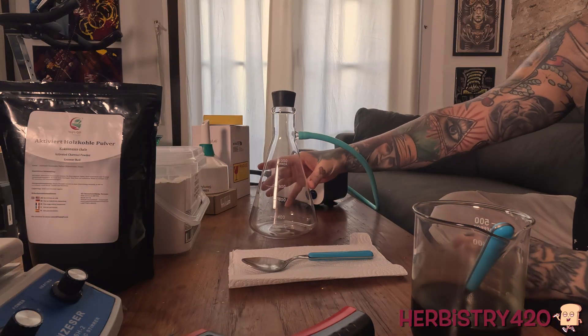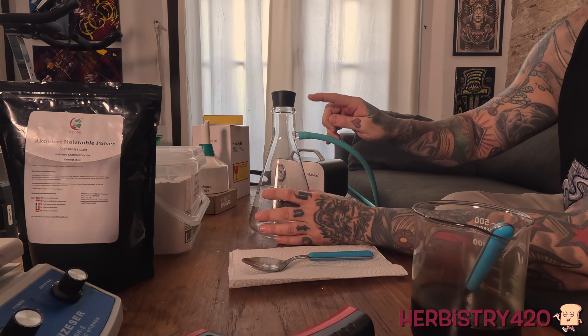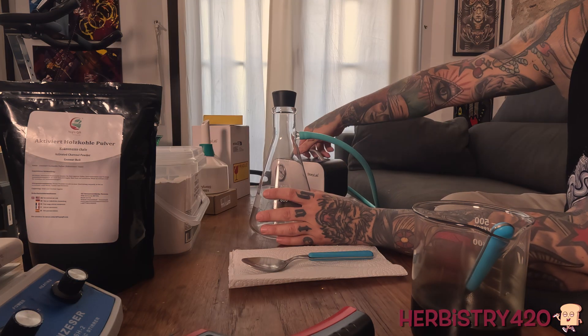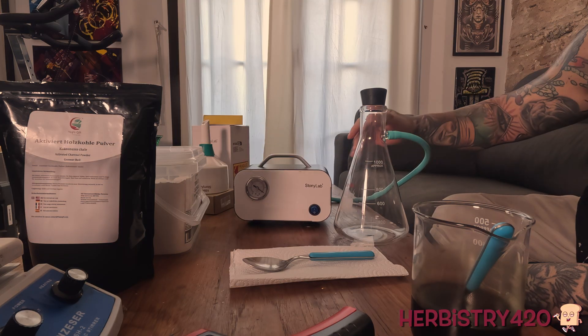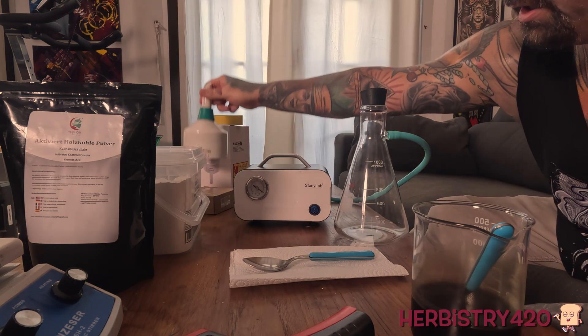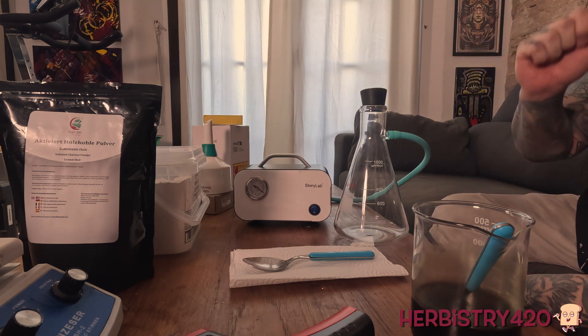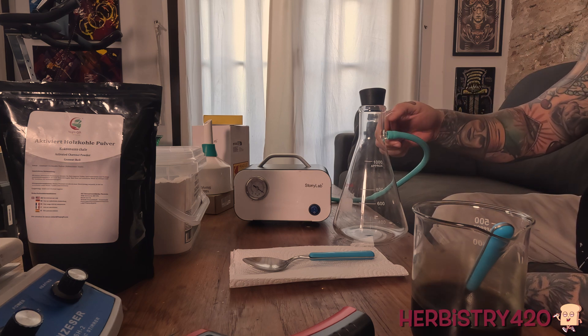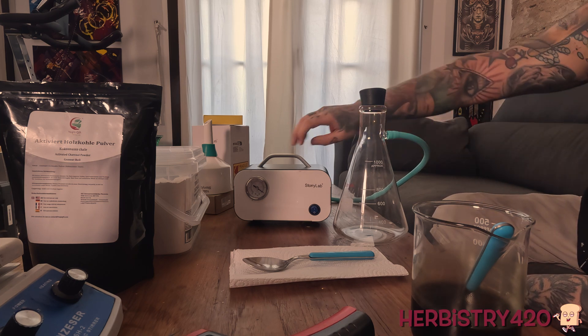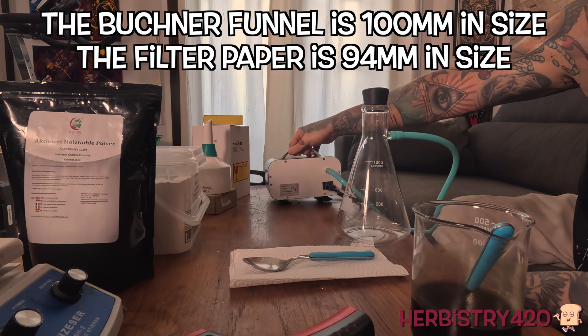Let's go to the other camera and check out the new gear. Number one, I've got a new flask and the flask has a little port right here to accept this vacuum hose. This is a specific vacuum pump by Stony Lab. In fact, Stony Lab is the one who made the Buchner funnel, the flask that I have, et cetera. This is a one liter flask right here with a joint right here for a vacuum hose. The vacuum hose connects to the back of the pump right here.